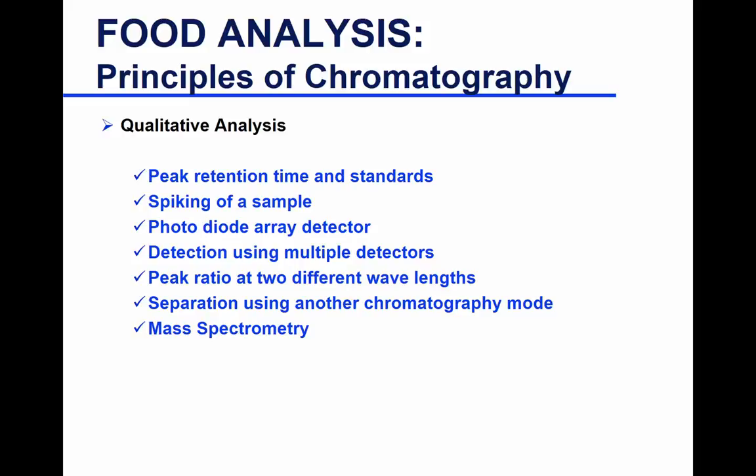Mass spectrometry, you're going to have two lectures on mass spectrometry. Again, it helps you with giving you additional information like the molecular mass. So if you know the molecular mass, you know how they absorb, you can look at the library and try to detect what you have. So you have different ways. You can add, the list can grow. NMR can be added to this for structural identification as well. So really, you can do a lot of different things to detect and identify.